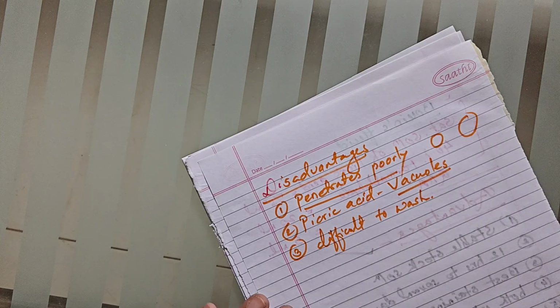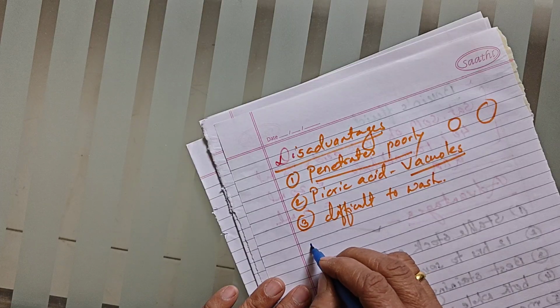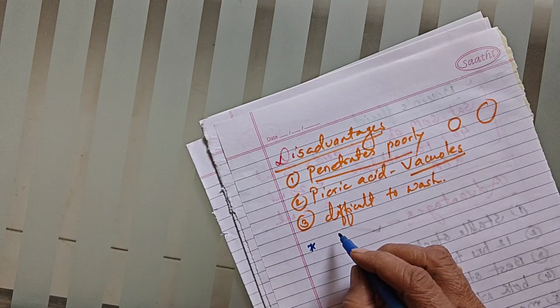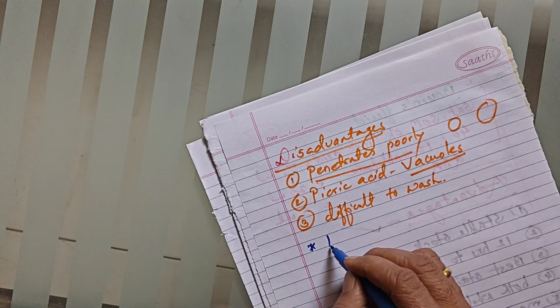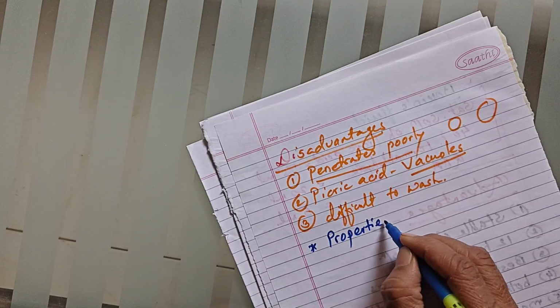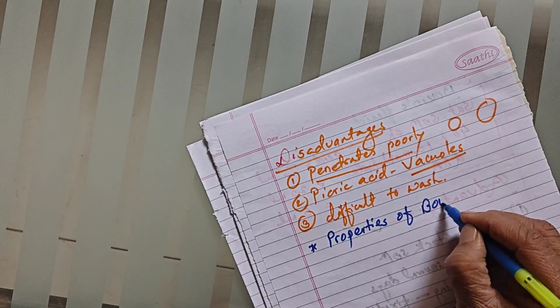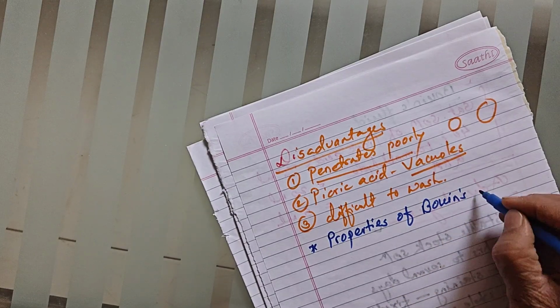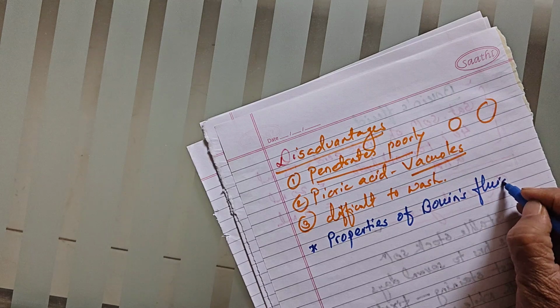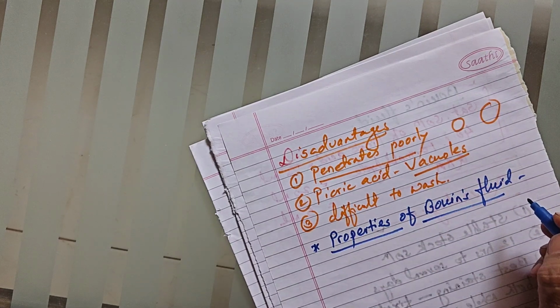Now we will focus on properties of Bouin's fluid. Okay, friends.